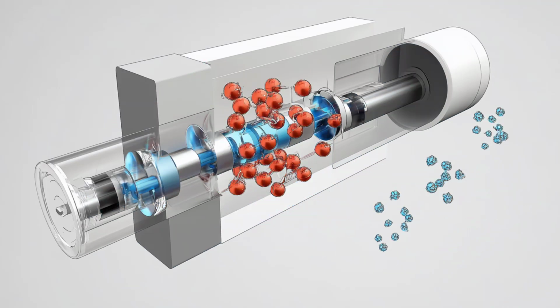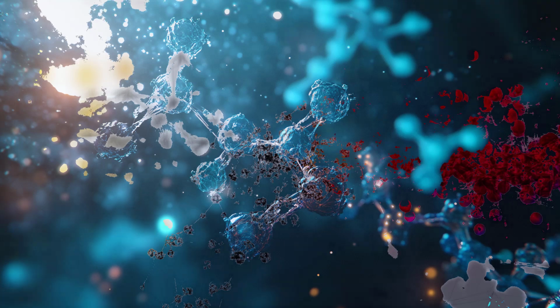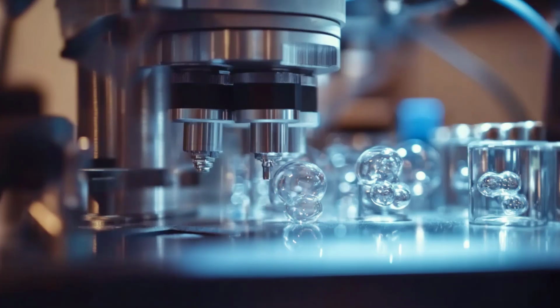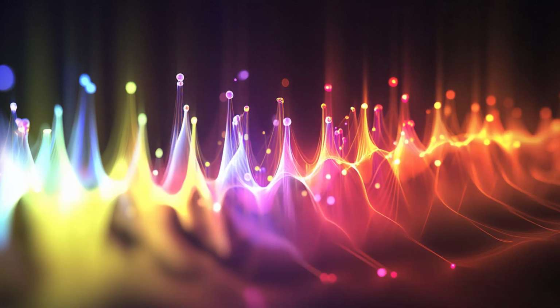Mass spectrometry is widely used in fields like chemistry, biology, environmental science, and forensics due to its sensitivity and precision. It can analyze a wide range of substances, from simple gases to complex biomolecules like proteins and DNA. Mass spectrometry is used to detect drugs in forensic investigations by identifying specific molecular fingerprints. It is like a molecular detective, uncovering the identity of substances by analyzing their atomic fingerprints.